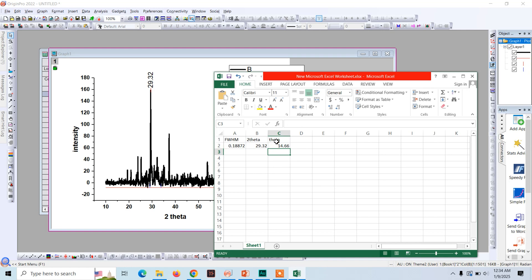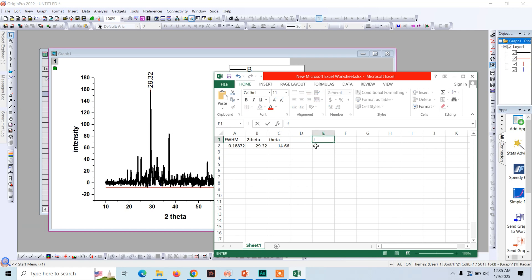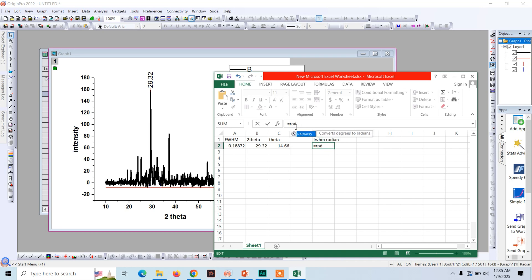And this will be equal to 29.32 divided by 2. This will give us just theta which is 14.66. And now we are going to convert the FWHM and theta values from degrees, the unit here is in degrees, so we need to use radians. FWHM in radians. Type radians. And now click on this.